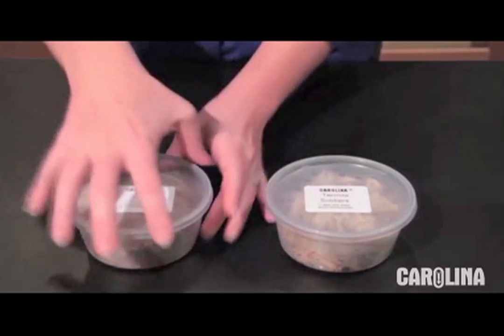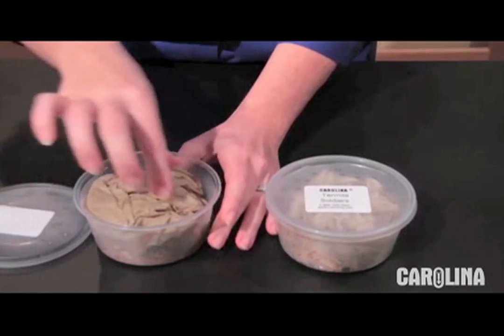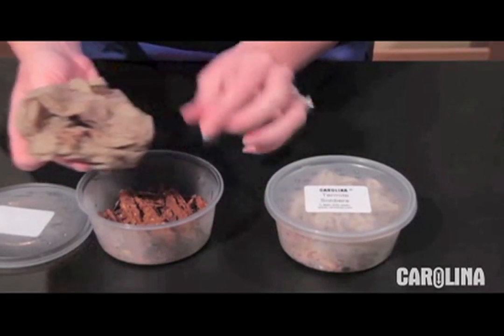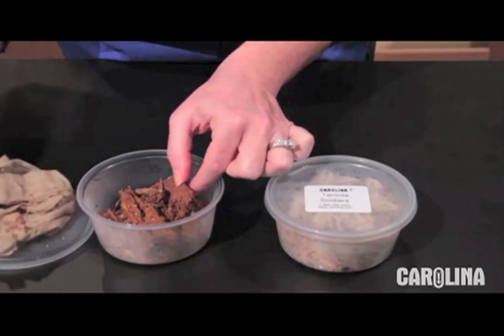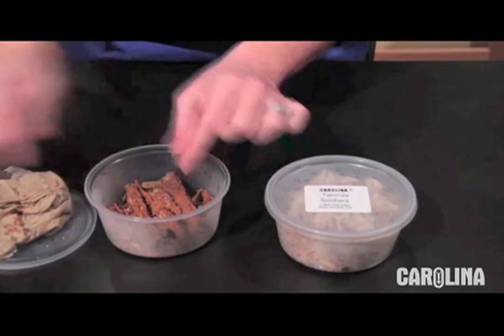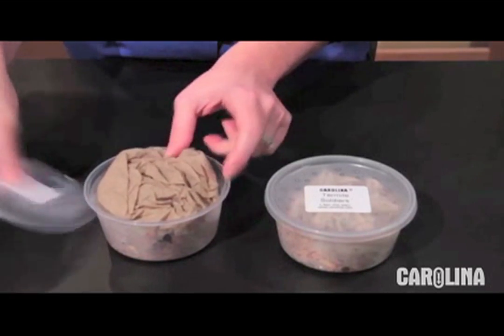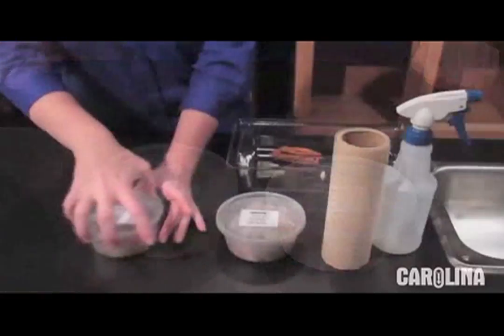Termite cultures will survive for about one to two weeks in the shipping container. However, we recommend using them as soon as possible after receipt. When you receive your termites, remove the lid and examine your termite order carefully. Please take a minute to check the wood and inside the paper towel, as sometimes the termites will be drawn to the moisture found there. The life of your termites can be extended by adding layers of moist cardboard or paper towels in the culture container. Pieces of untreated rotting wood may also be added.